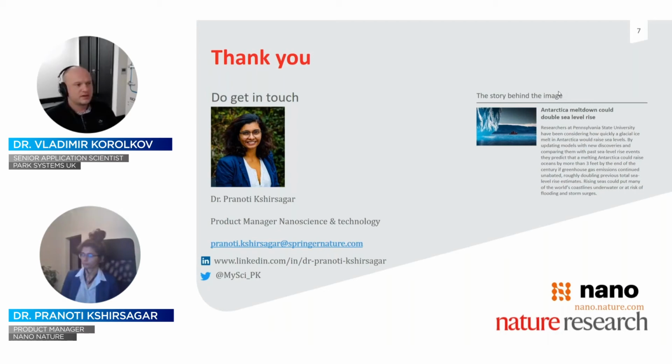Right. Well, thank you very much, Joyce. Indeed, sample preparation is critical for AFM imaging. In terms of sample preparation for this particular presentation I gave today, there isn't any. It's literally a piece of Teflon tape, and I can show you.